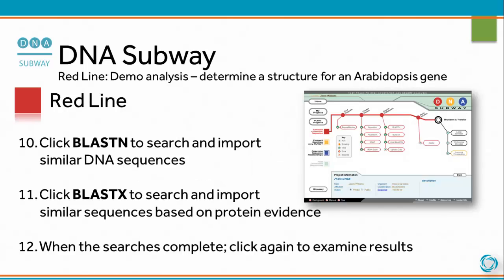Click BLASTN to search and import similar DNA sequences. Click BLASTX to search and import similar sequences based on protein evidence. When the search is complete, click again to examine results.